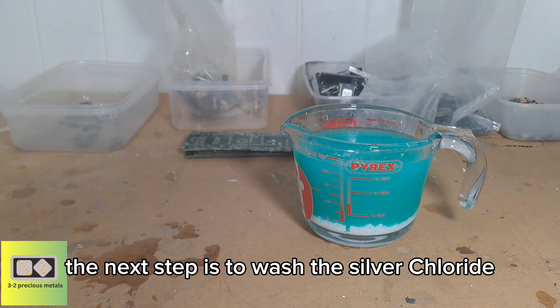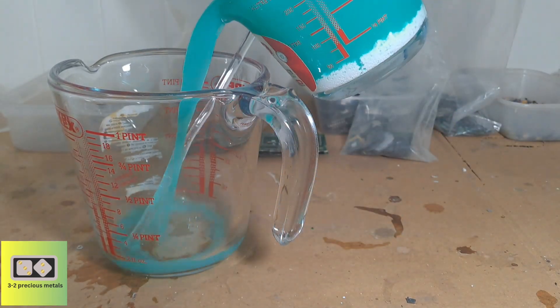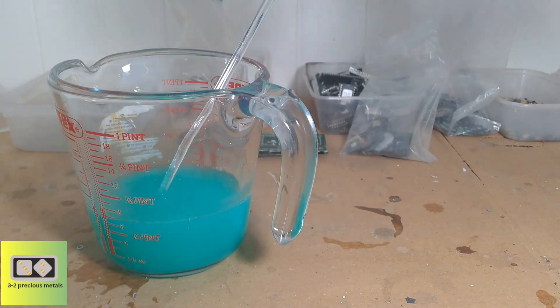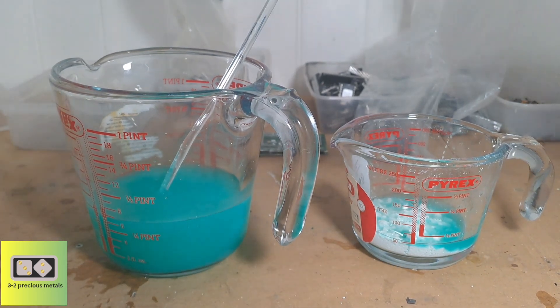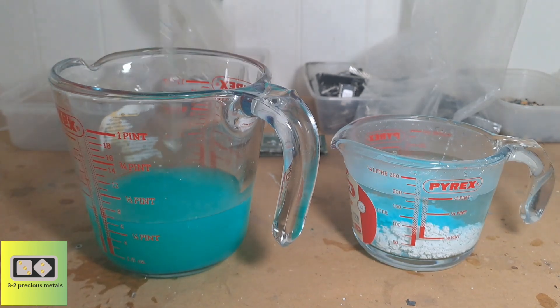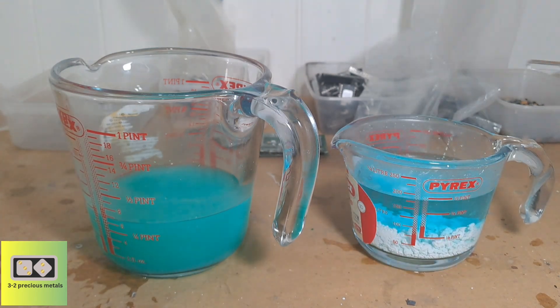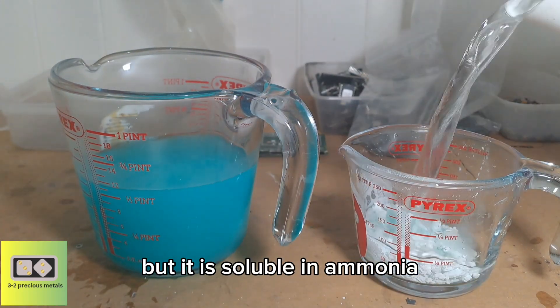The next step is to wash the silver chloride. This is done to remove any copper that may be in the solution. It's just a case of rinse and repeat — silver chloride is insoluble in water but it is soluble in ammonia.